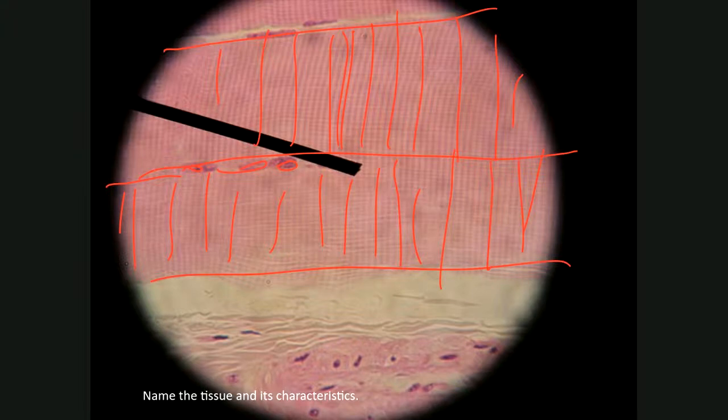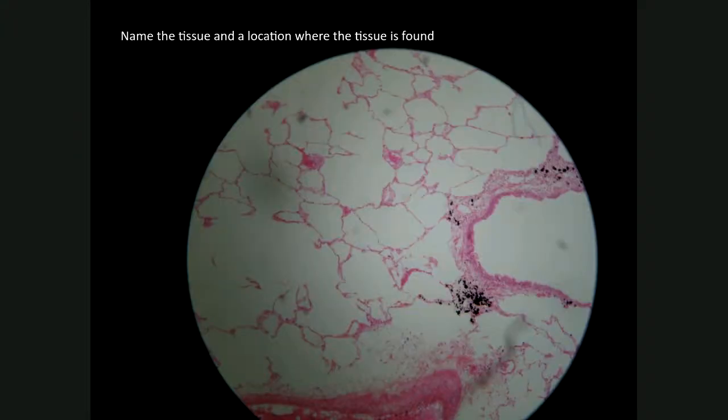All right, this tissue right here, we have a lot of this. So this is all surface. So that should immediately indicate epithelial tissue. When you see that much surface, think epithelial tissue, more surface here. These little red lines are going to be the cells making up the tissue. And so that leaves us with flat cells. So this is simple squamous epithelial tissue.